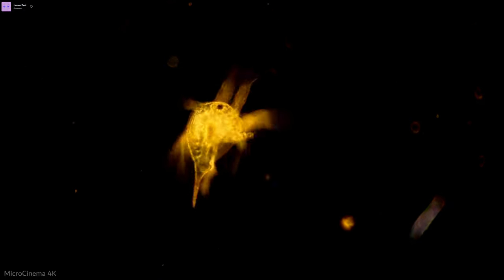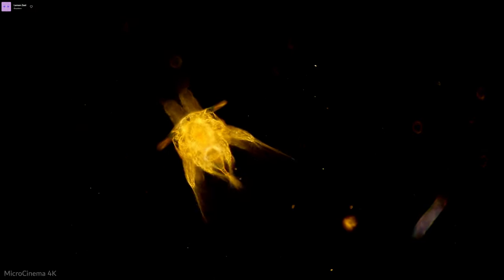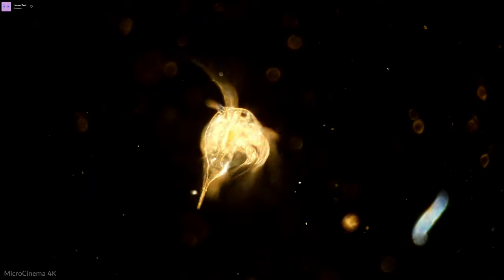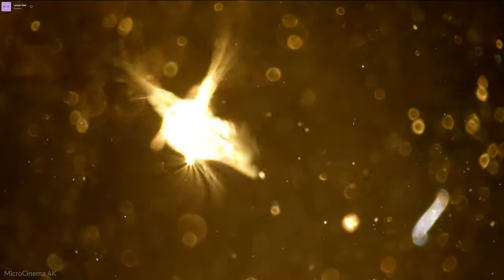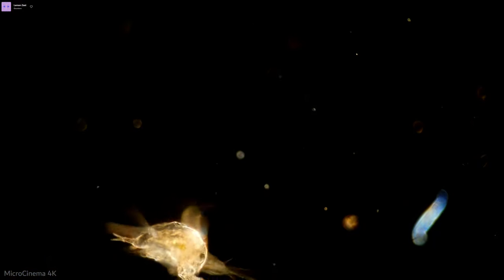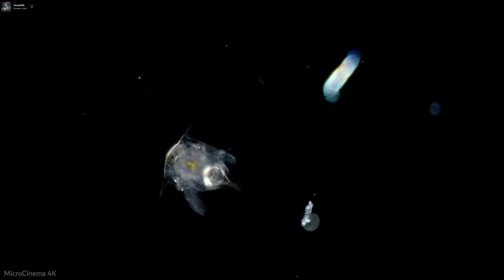Oh man, messing with polarized light. So again, this is all I'm doing right now. Let's see, I can take off the... this is just the cross polarizers now. I'm just messing with a wave plate and then also some cellophane. Cellophane just has some interesting wavelength dependencies. It's better when you combine it with a wave plate, that's for sure.